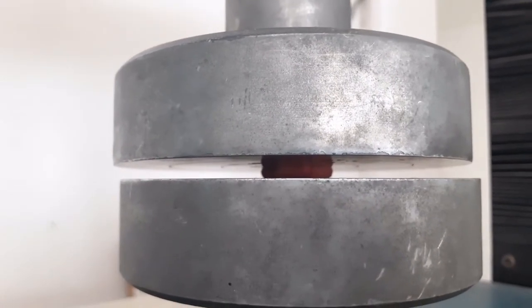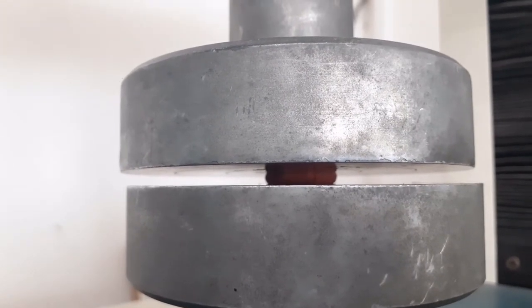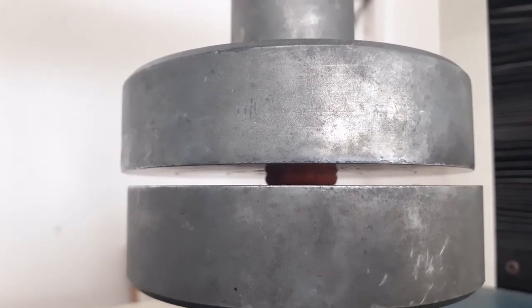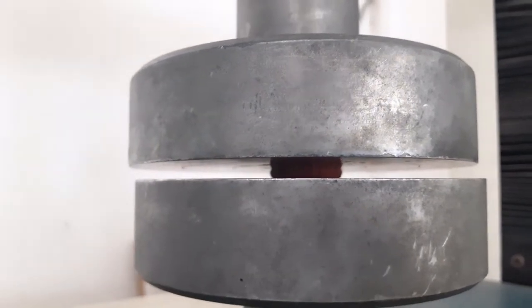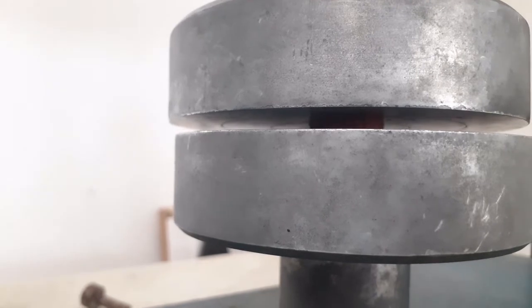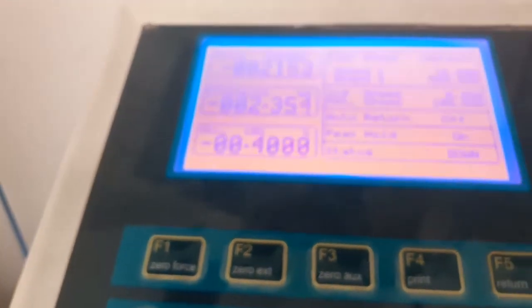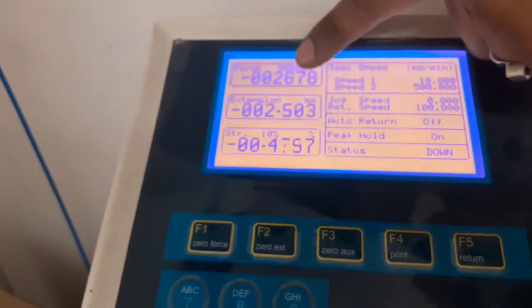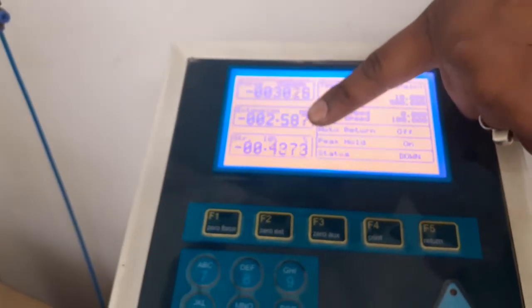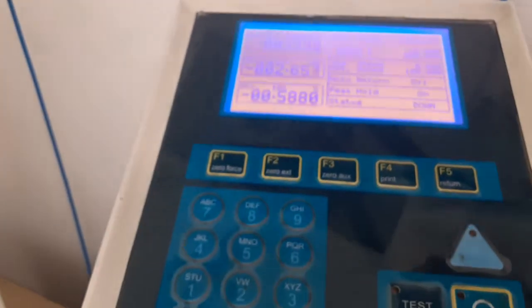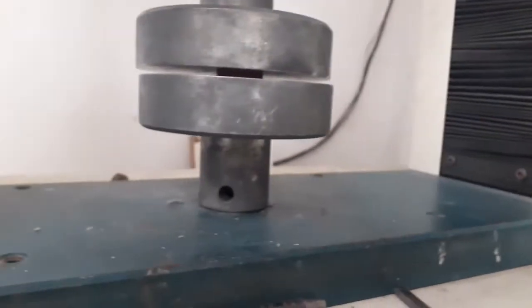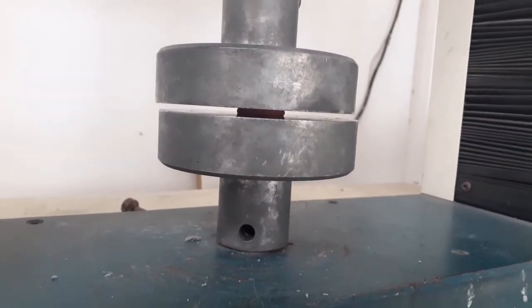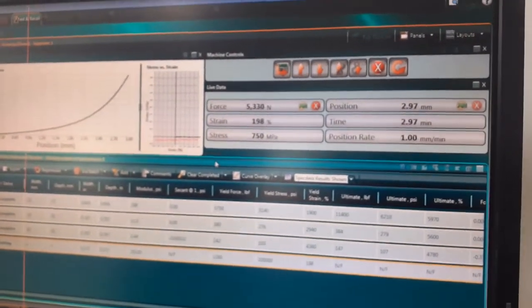The force is approximately 1200 and the sample is compressed around 2 mm. Here also you can see the values: this is for force, this is for position meaning extension, and this is for strain. You can see here in this software the force is increasing.